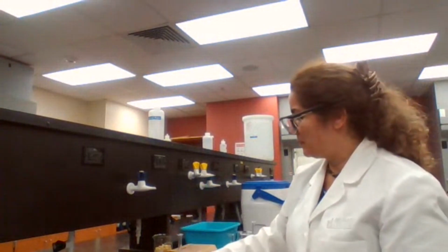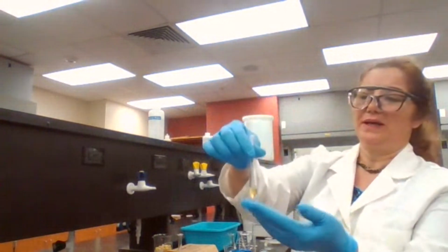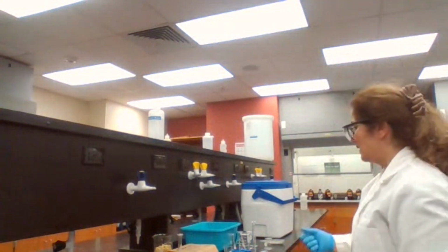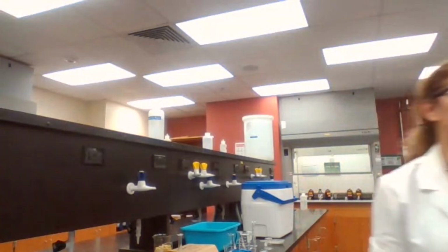For the acid mixture of methyl benzoate, it's not what I like. It wasn't supposed to be this dark of a yellow color. It should be more of a tan. I'm going to have to get a clean test tube. 0.4 milliliters of methyl benzoate. So that means every 2 drops would be 0.1 milliliters.